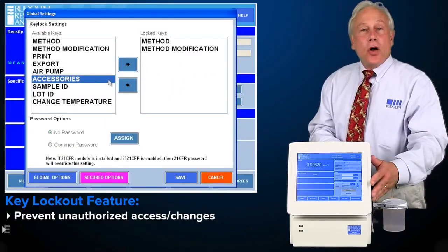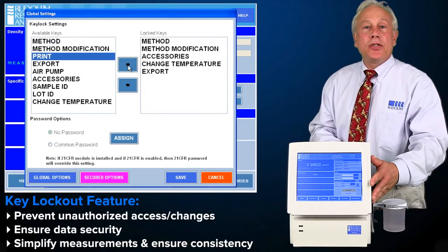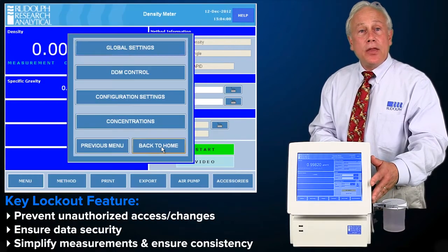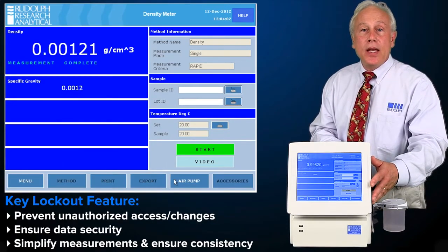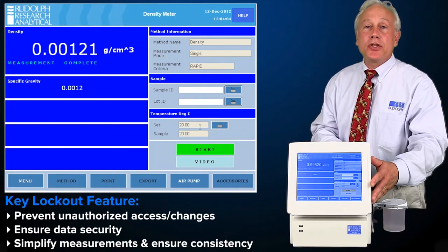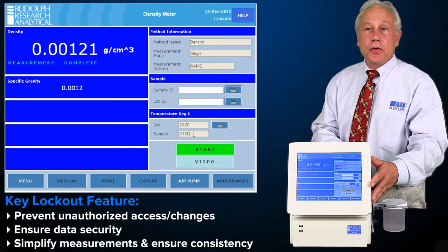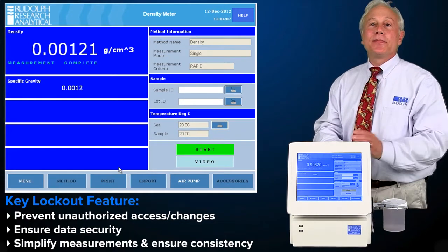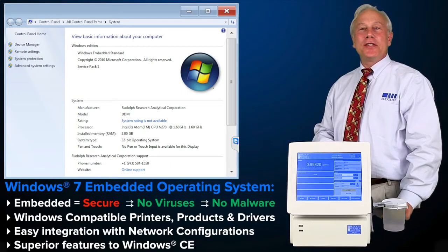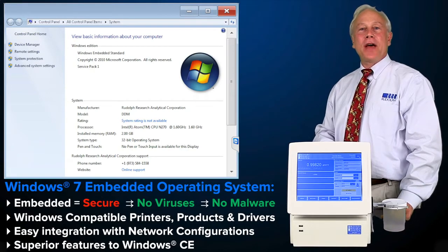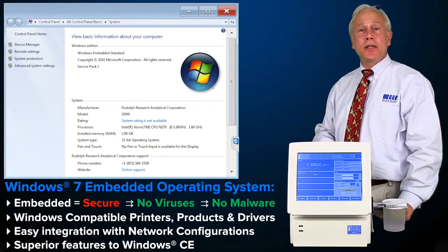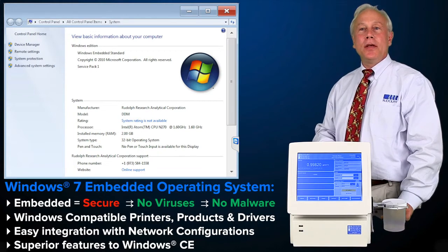Any and all of the buttons and menus on the main screen may be either password protected or have a key lockout to prevent unauthorized changes if so desired. One of the primary reasons for the power and flexibility found in the Rudolph density meters is its operating system, Windows 7 Embedded.